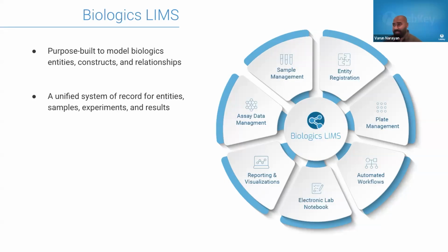Not only that, but it's also a unified system of record for your entities, samples, experiments, and results. So not only can you capture all of the biological entities you're working with, but you are also able to link that alongside your samples and your experiments to get a holistic view and idea of your data, which allows you to answer those cross-study questions. It allows you to perform comparisons on your data and also analyze trends over time.